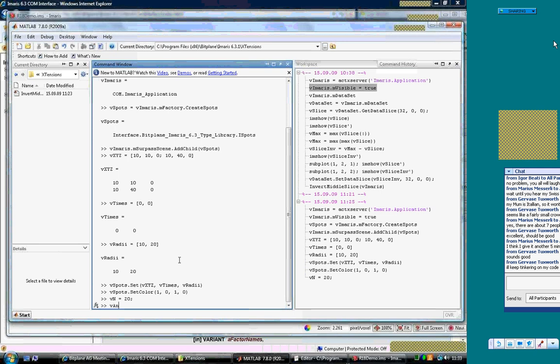We can use a Matlab function called linspace, which can generate a list of values between two limits. So the minimum we want is 0, and then let's say in radians we specify 3/4 of a circle, and we want 20 values.